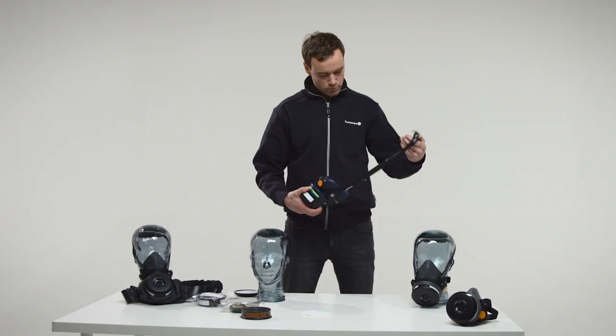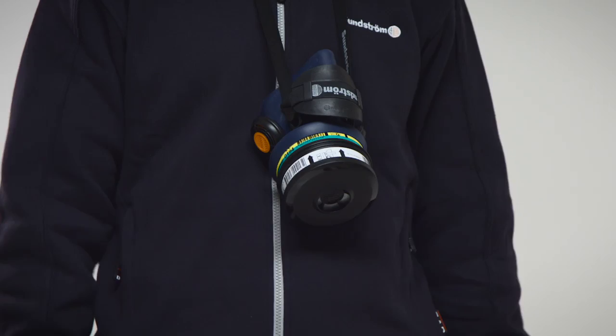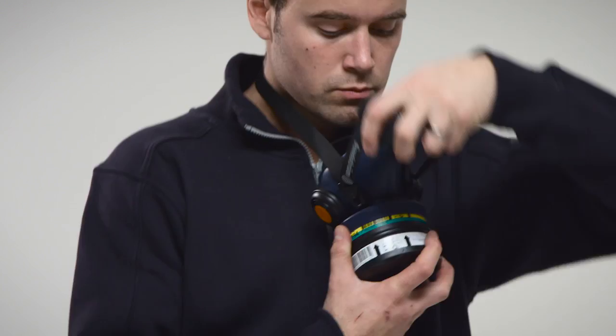Holding the strap buckle, pull the strap over your head and put it around your neck. Let the mask hang on your chest. Grab the pad with one hand and the filter with the other. Hold the mask against your face. Pull the pad over your head and place it on the crown of the head.